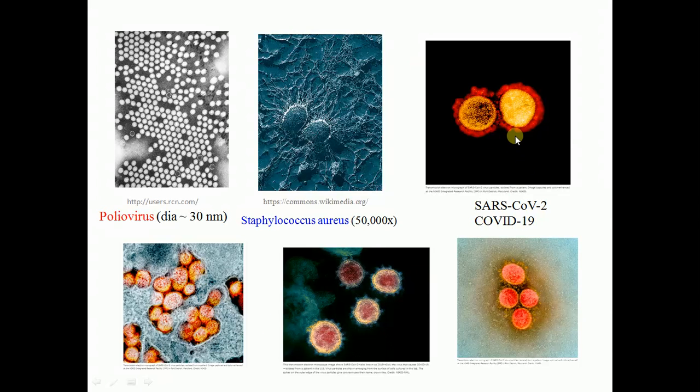You have the choice in your recording device, or in your computer program. You create a computer program in such a way that it recognizes elements, for example, from the EDAX technique or EELS technique, and you get a different color for the different things, and therefore colored images are created. These are not directly seen, keep in mind. Even in the case of SEM, I have shown colored images in my previous lecture. So it is not the artifact of your instrument, it is the artifact of your program.